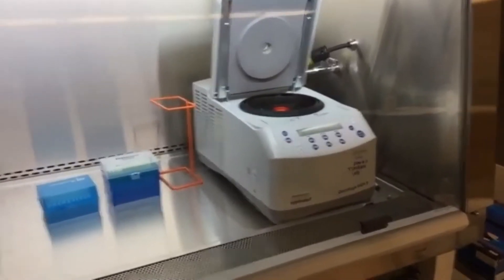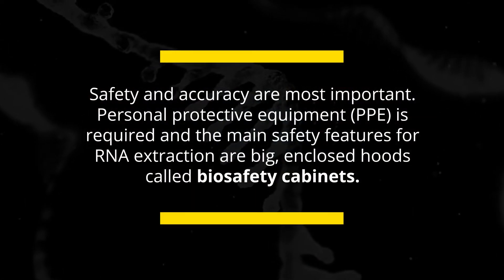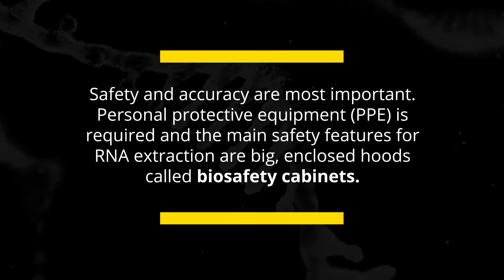The important thing to stress here is that this biosafety cabinet is the heavy lifter in terms of providing safety in the lab going down the line. There are three on this side and three on the opposite side of the laboratory.